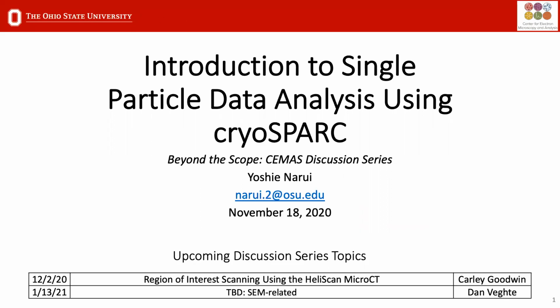Okay, if we take a look at these classes, immediately you can tell which ones are no good, right? If you look underneath, it gives you some information about the resolution. You'll notice that these are ordered, I believe, from highest resolution to lowest resolution. But you'll notice it jumps between these two, from around 8 to 18. So what I would do is select these first 17 or so classes. Clearly they're very similar. Some are side views and some are top down, but we just wanna select everything that we think is a real particle.